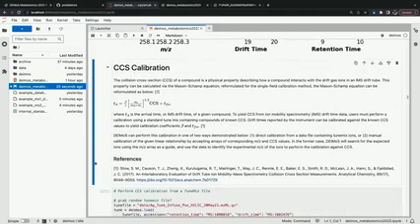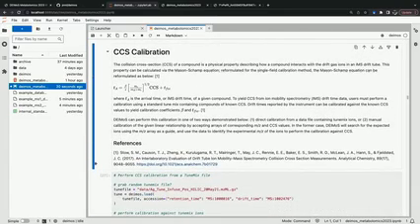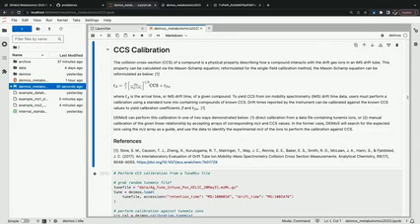So now, what everyone is interested in this workshop for ion mobility: CCS calibration. Many of you are probably familiar with this equation here. The Mason-Schamp equation can be reformulated into approximately linear format based on these included parameters. If you have a mixture of ions with known CCS values, you can calibrate your CCS for your instrument, and that's the process known as calibration.